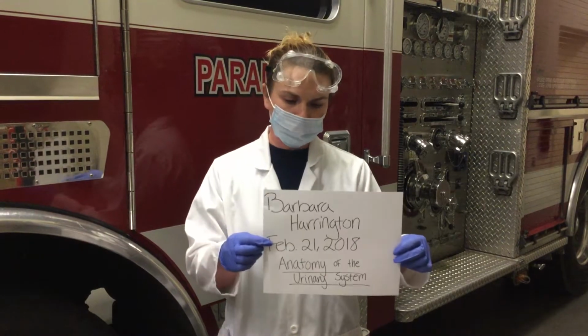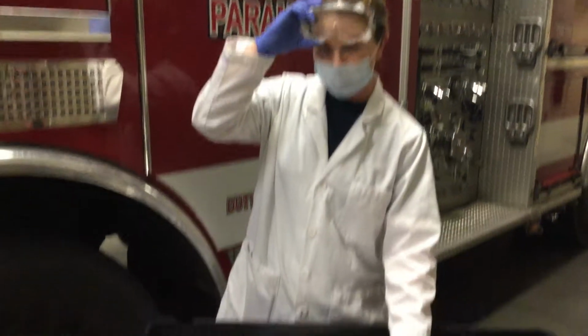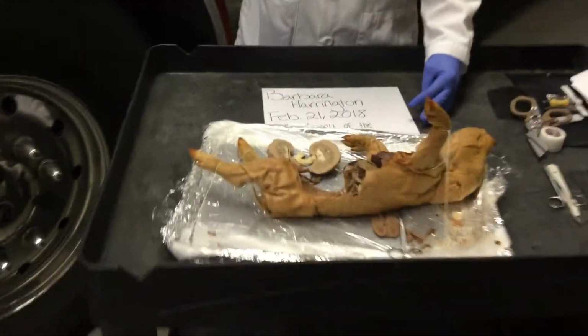We're going through the anatomy of the urinary system using our fetal pig this week. So let's dive in.